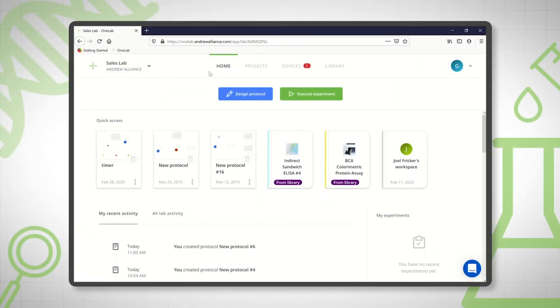So on the home page you've got these four tabs across the top. Home obviously brings you back here.